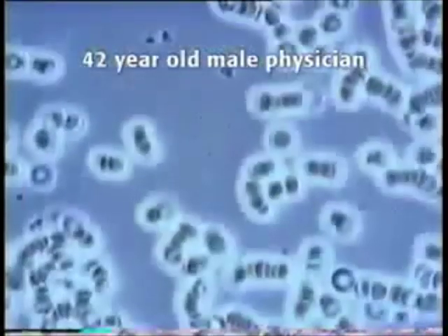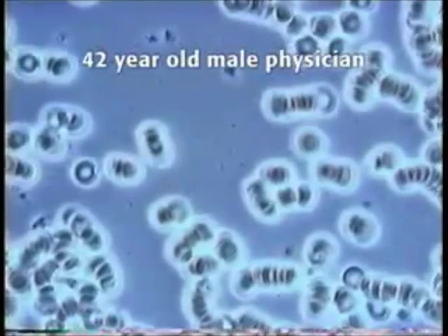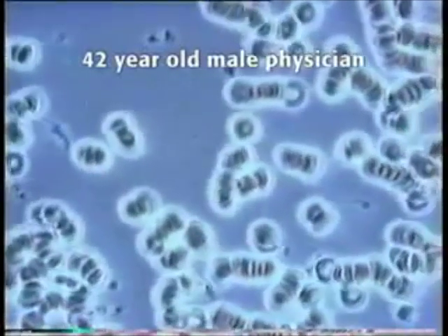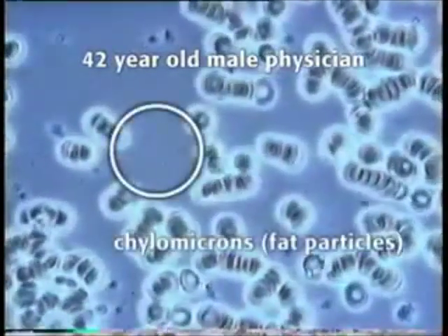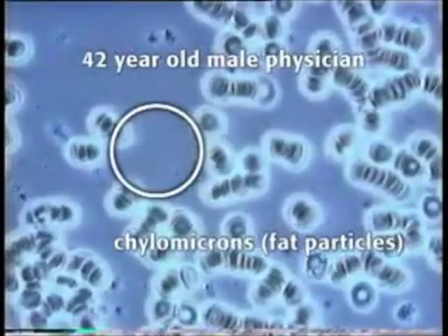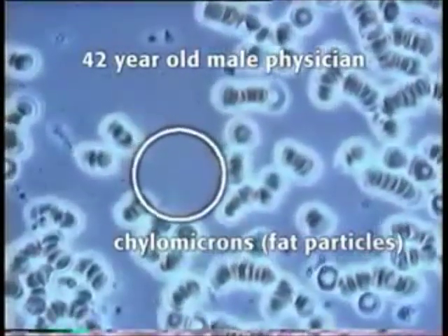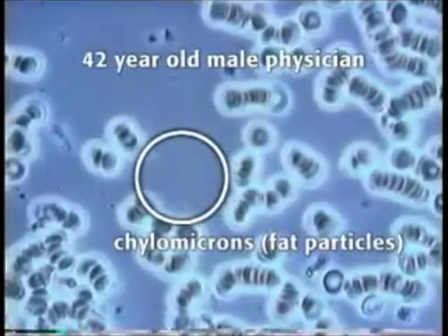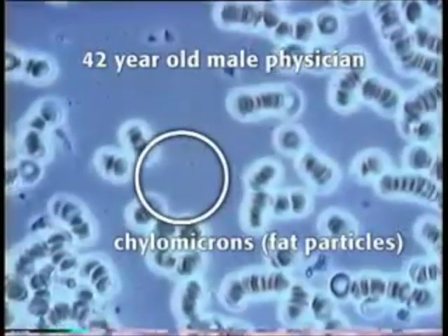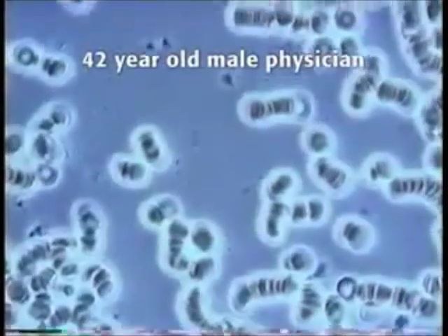This next sample is a sample of a 42-year-old physician who came along to observe the state of his blood. The first thing you may notice is lots of small moving particles on the screen. These are called chylomicrons. Chylomicrons are the result of eating a high-fat meal before coming in for the microscopy. In fact, this man had an Italian meal with a high olive oil content. He came not because he was ill, but because he was interested in microscopy. So in fact, this sample is a sample of someone who's relatively healthy.